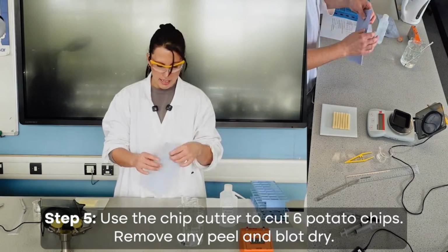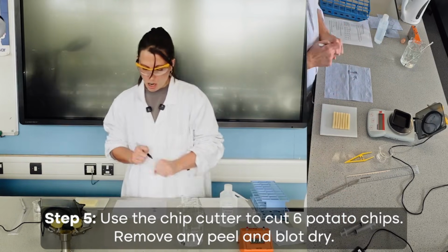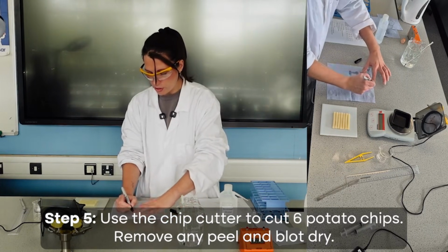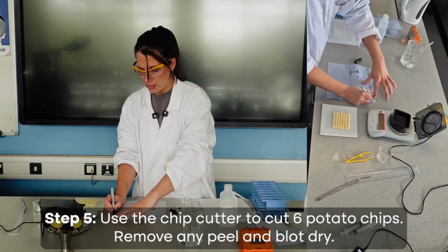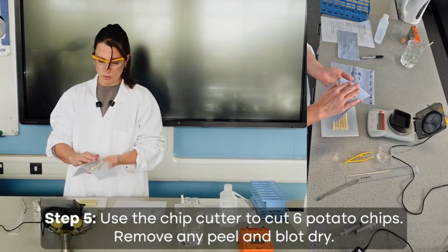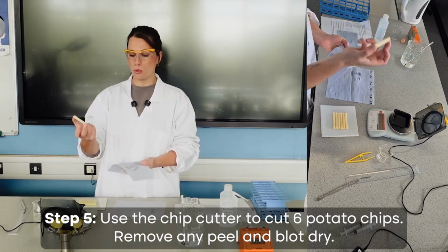But what we can then do is, on a piece of tissue paper, or it could just be a piece of paper, to make sure we don't mix up which is going into which, I would now actually write on my tissue paper that this is the potato I'm going to put in at 0, 0.2, 0.4 concentration, 0.6, 0.8, and 1. I've also got some tissue paper here ready to blot them dry. And again, not squeeze, because if you squeeze, it's going to draw water out from within the cells. We just want to remove any of the water on the outside because that's not actually the mass of the potato. That's just water on the outside.